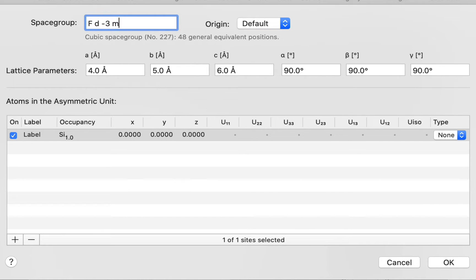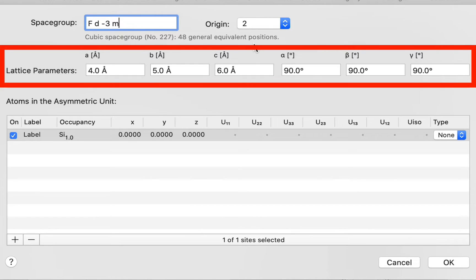Notice that as we type, the program checks our syntax. This particular space group has two possible origins and we're going to tell the program that we want the second origin. This interface will appear familiar to those of you with CrystalDiffract or CrystalMaker. Now we need to specify our unit cell dimensions, and this is where the program differs from CrystalMaker — Single Crystal lets you experiment with distorting the unit cell parameters.